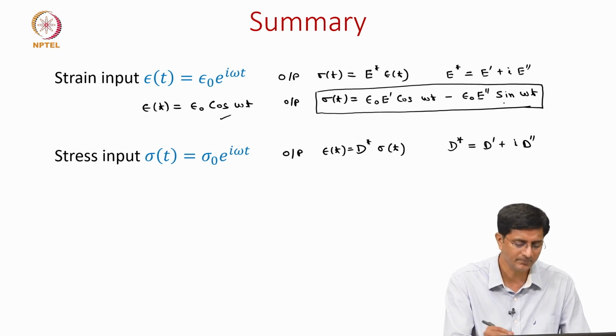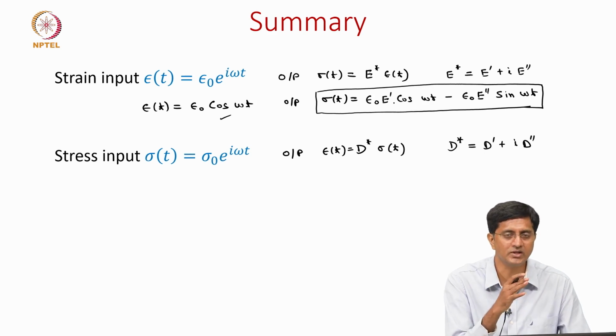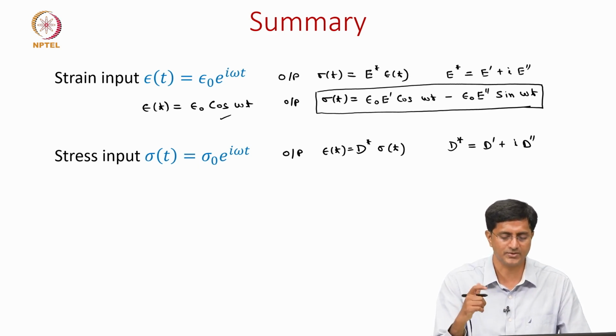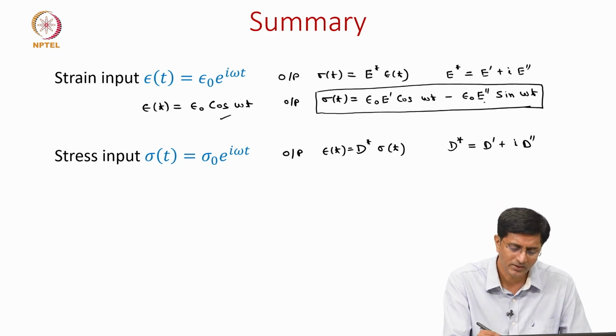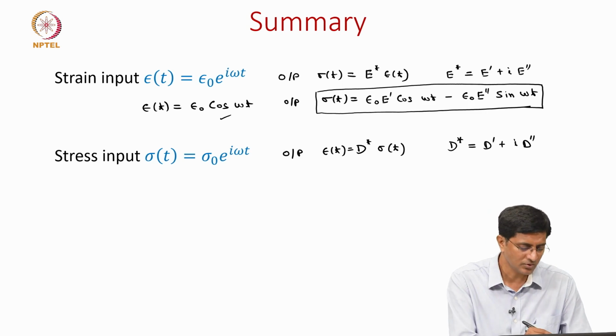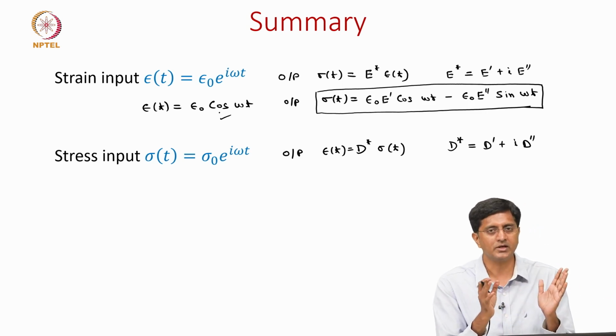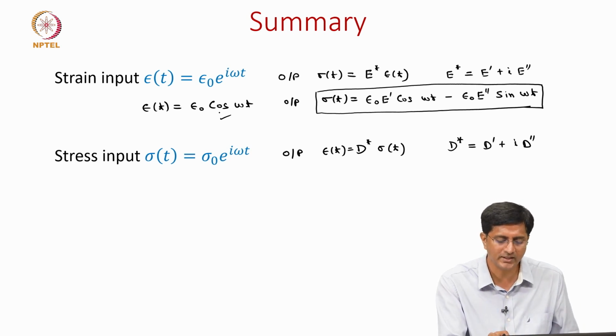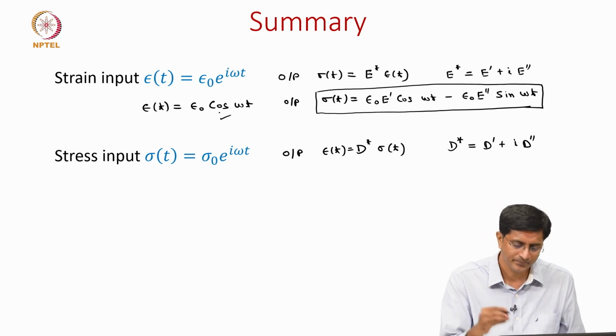What it means is the first term which is in the cos term is in phase with the input, which means both reach the maximum and the 0 at the same times. But the second term is completely out of phase from the first term. So, because we know that the cos and sine are two perpendicular functions, we can say that the second term is out of phase.